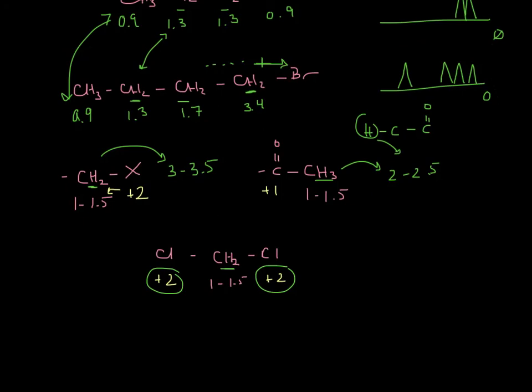So these hydrogens would overall show up somewhere between about 5 and 5.5 ppm. And you can do this if you're next to a carbonyl and a halogen, or 3 halogens, or anything like that. And it really is a good way to predict what's going on.